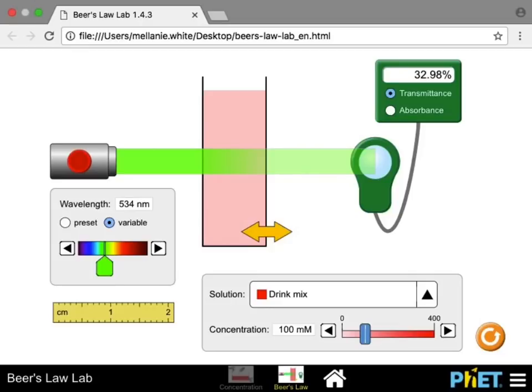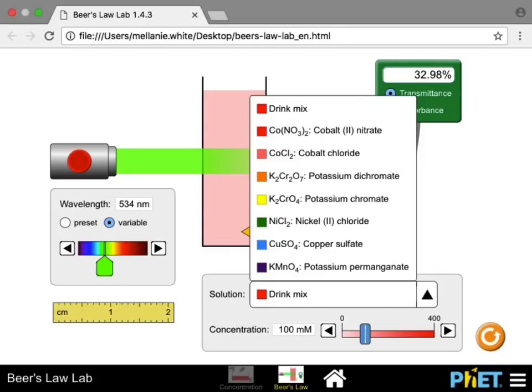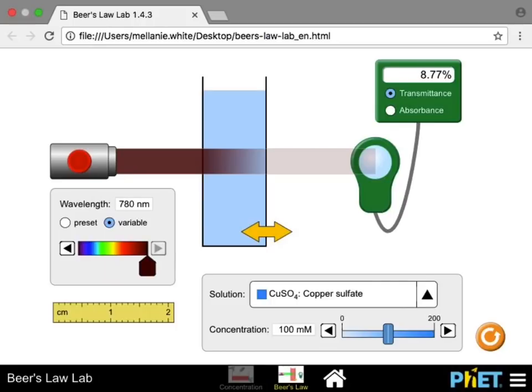So what we can try, we're going to be doing copper sulfate. Copper sulfate is a blue solution, and we can change the molarity of what we're using. I know we're using 0.4 molar. What color of light should we use when we are choosing our wavelength? On my spectrophotometer, I have 4 different wavelengths that we can use: 430, 470, 565, and 635. So what would be the best one to use? 635 is more red.